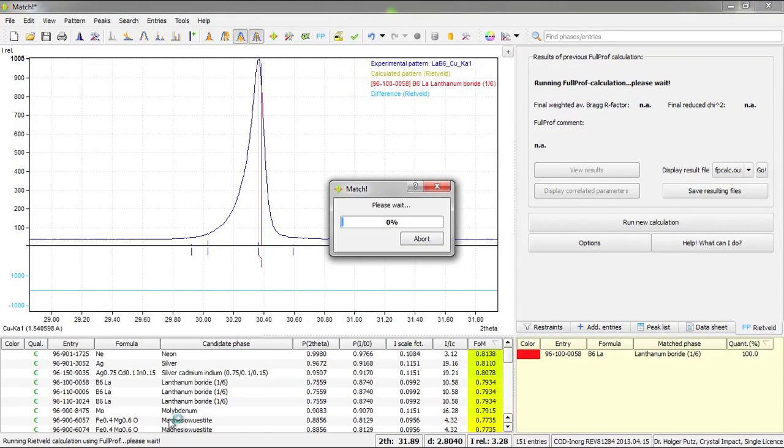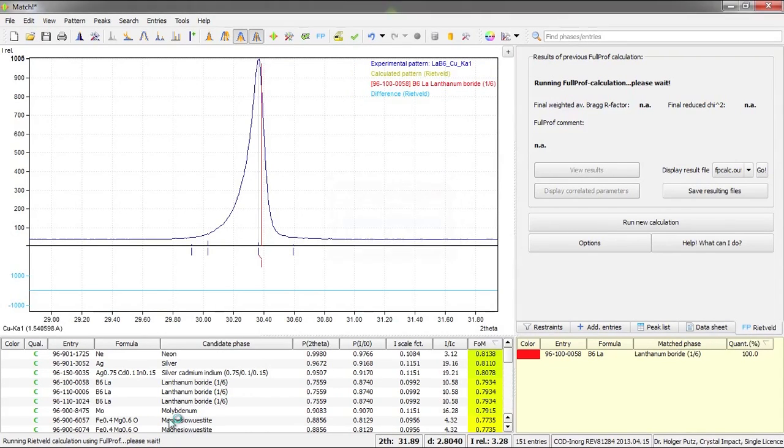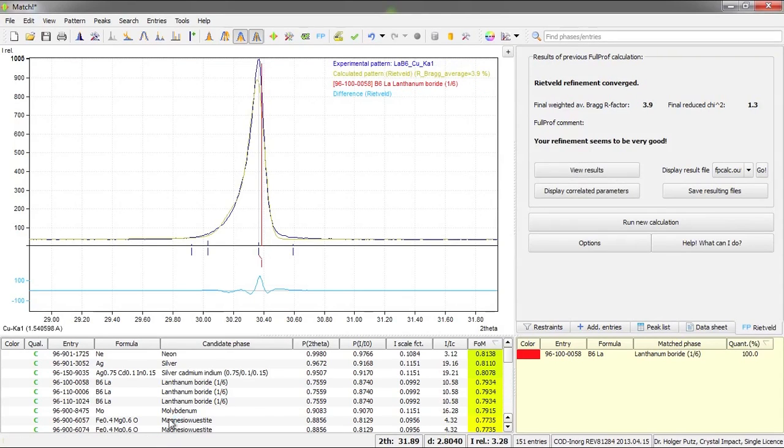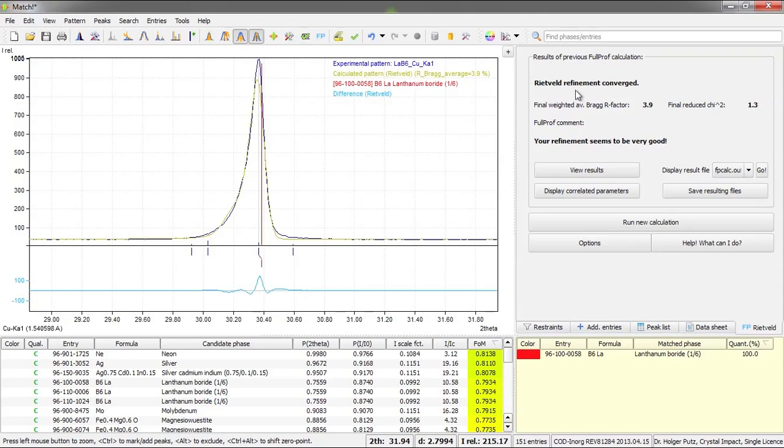Okay, it takes a little bit of time. But as you can see here, now the Rietveld refinement has converged and also the comment from full prof is your refinement seems to be very good.